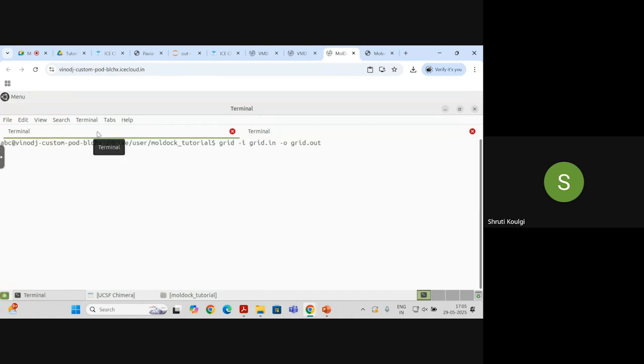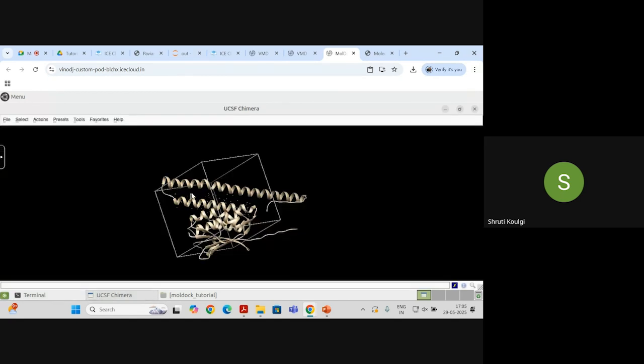You just look at the other tab. Why is this step so lengthy? The box that we have generated over here, in order to fit in the molecule, it is forming a grid across this box where the actual ligand docking is happening, and this grid will happen such that there are no steric clashes between these protein residues as well as the new small molecule that will be loaded.